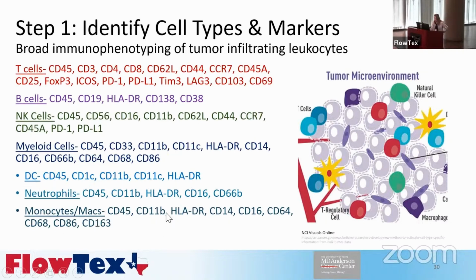And this is the list of markers that I have. And this, when I get my tumors chopped up, like Sarah and Leroy told you, and I get a nice cell suspension, is going to allow me to really characterize that in a powerful way.